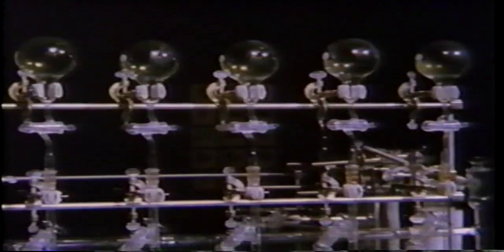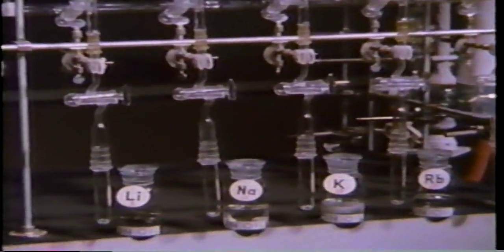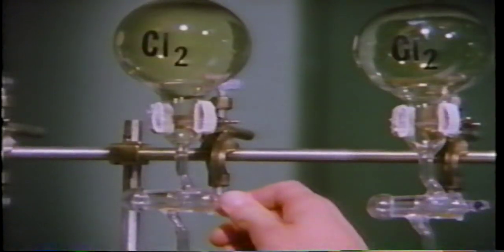Potassium reacted with chlorine. Do the other members of this possible family also react? The gas bulbs are now filled with the chlorine, and pieces of the 5 metals are in the reaction tubes. Here are chlorine and lithium.